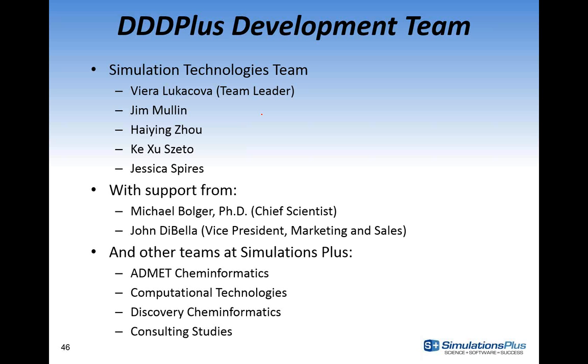Obviously, if you have topical products, other types of products, if we have the data and there's a big enough need for it, I would be glad to add them to the software and provide the equations and the tools to do so. But right now we mostly just have the oral products.